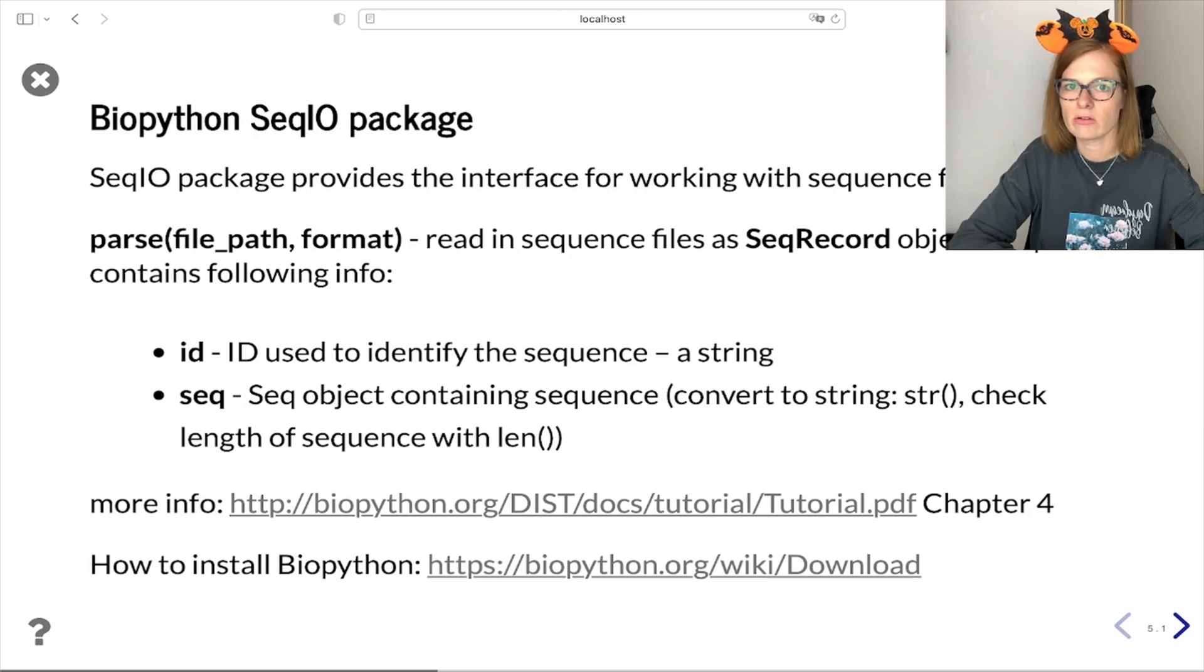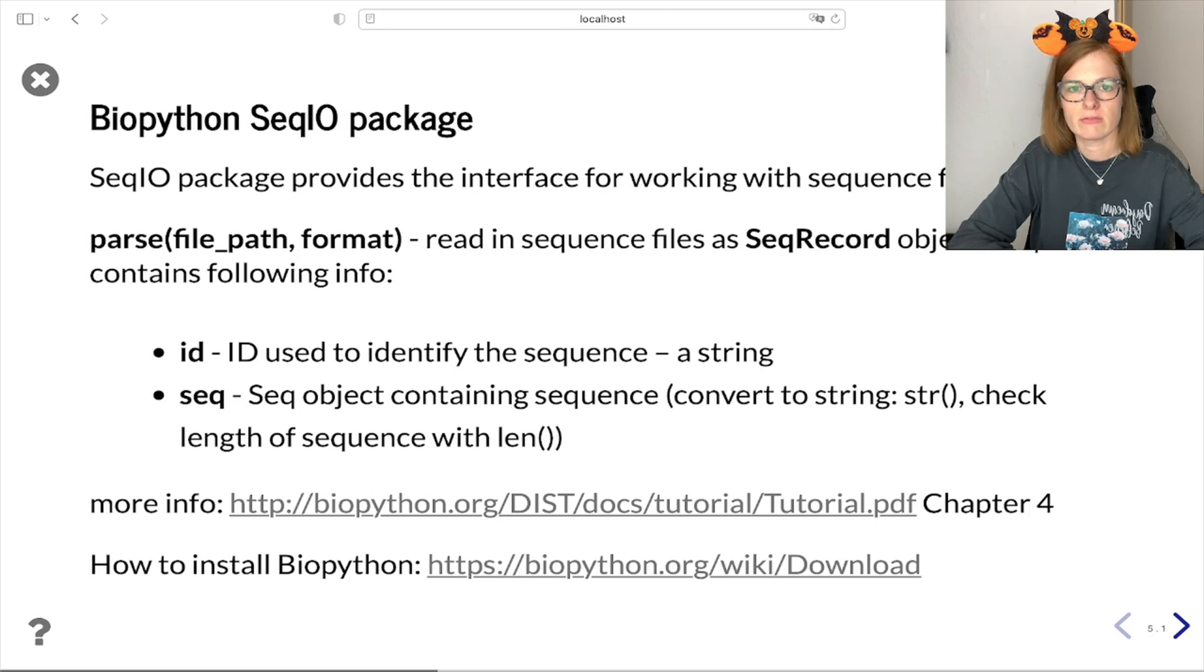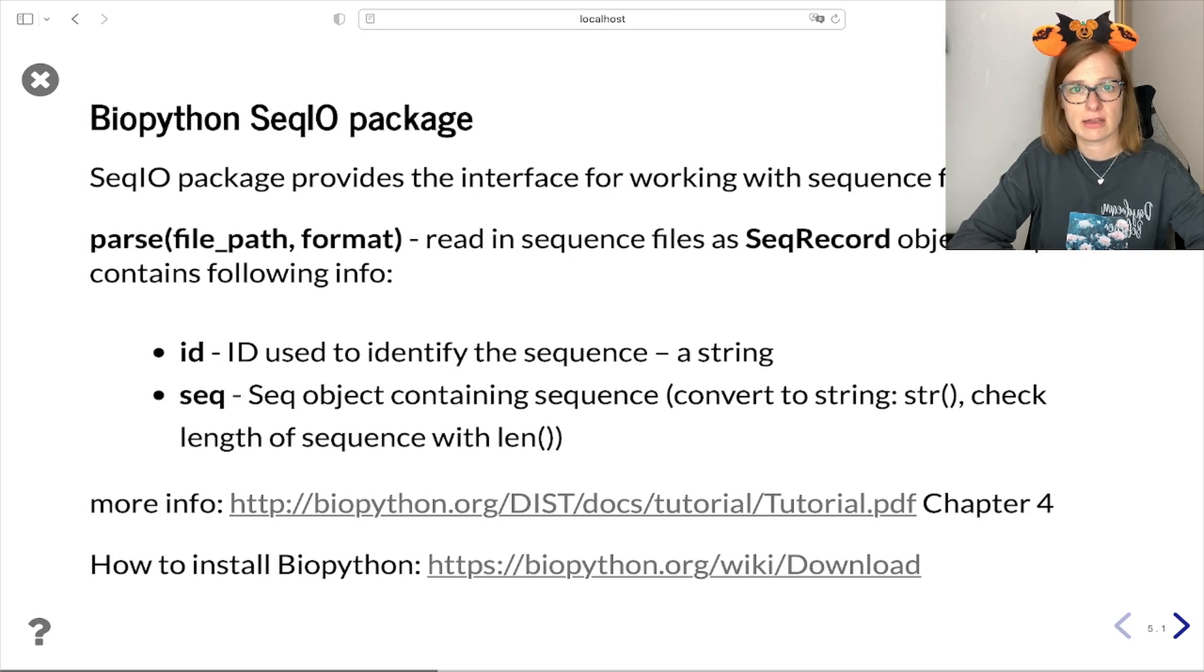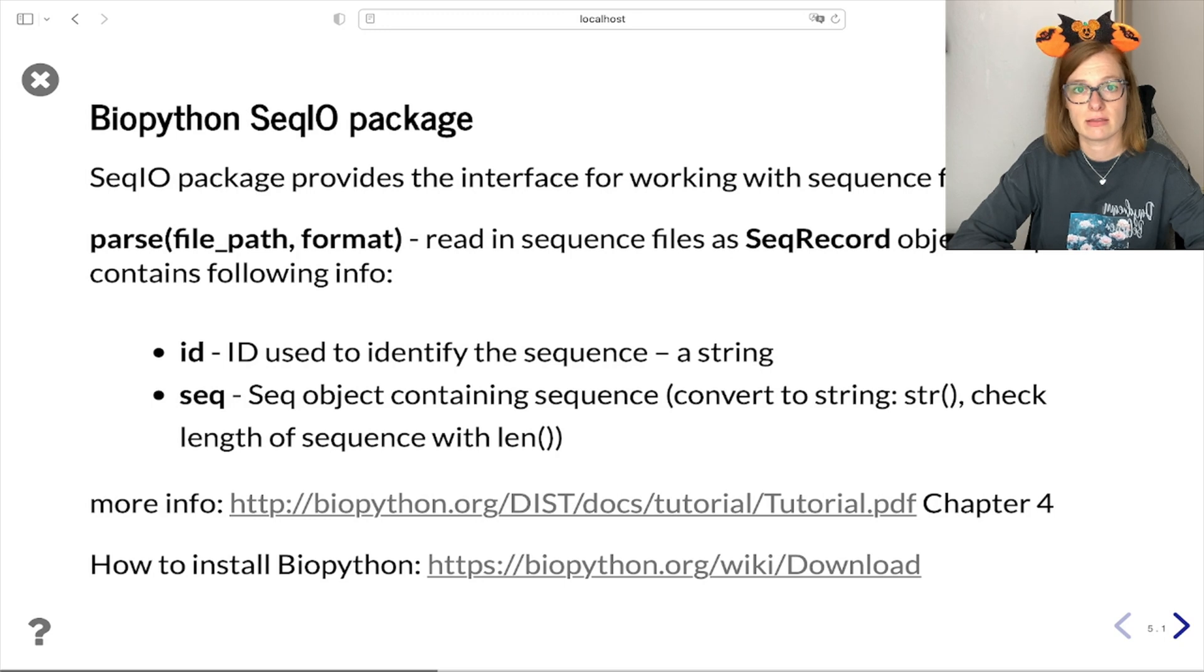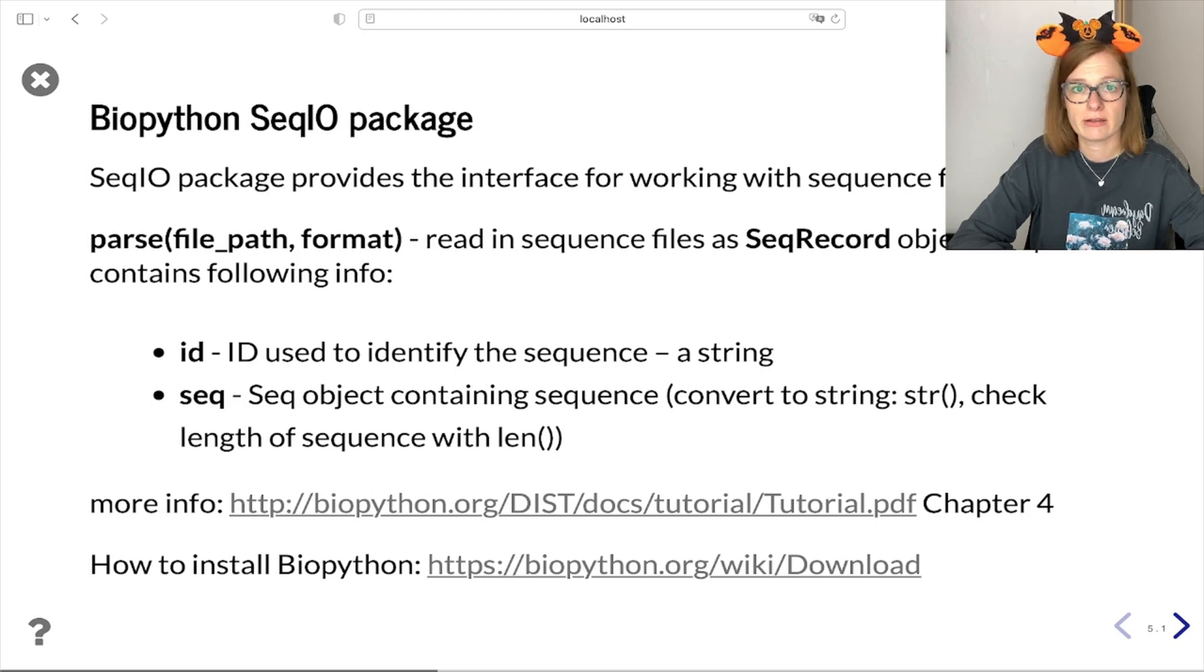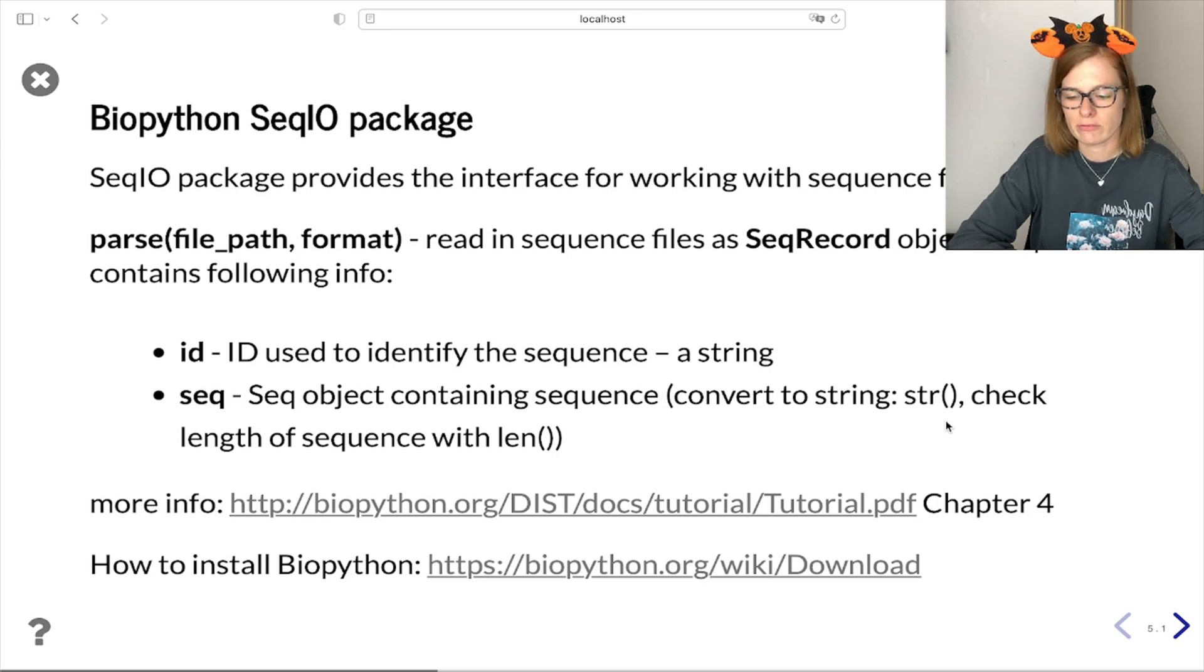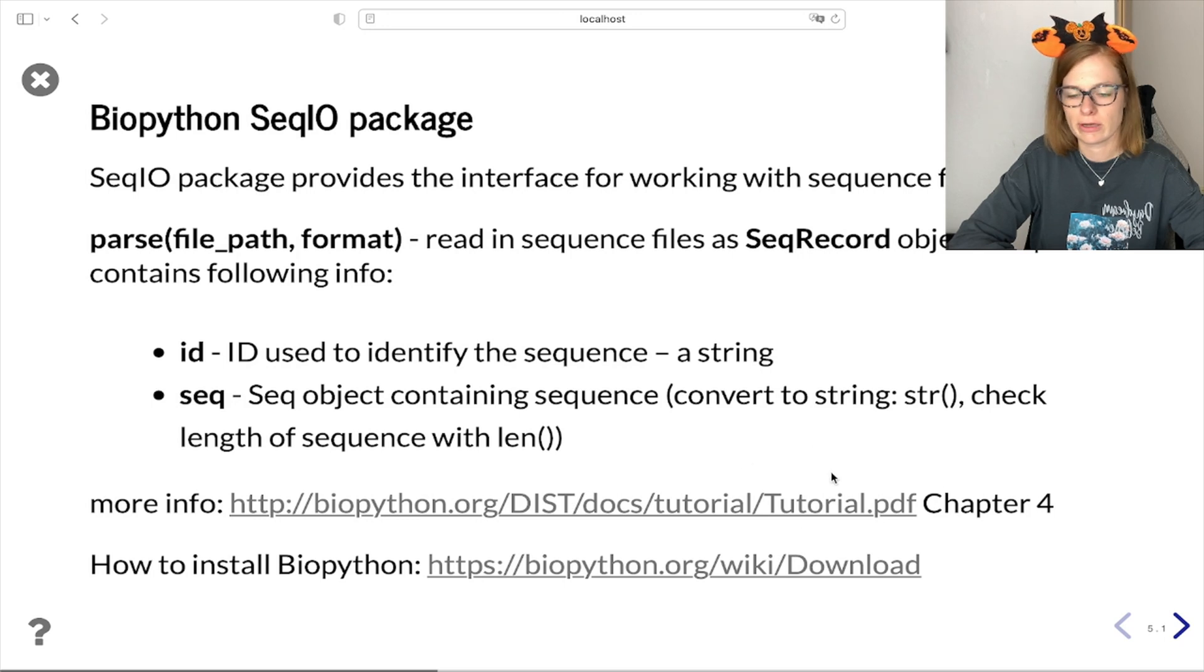SeqRecord alongside other information provides info about the sequence identifier and sequence itself. For more details about SeqIO module you can find a tutorial on the following link.